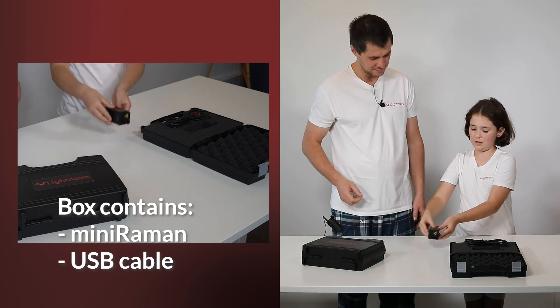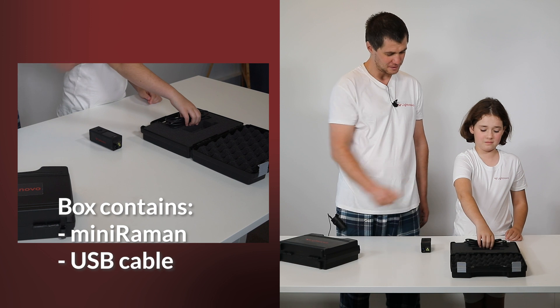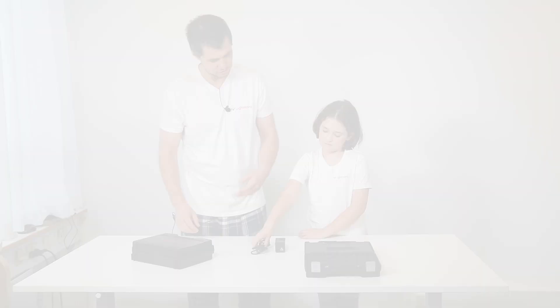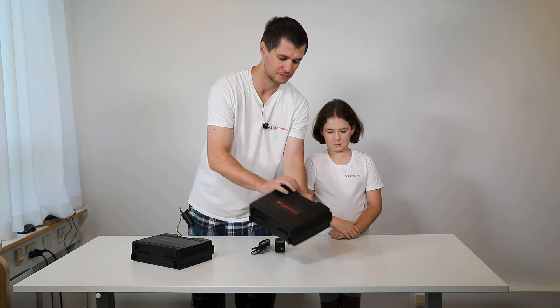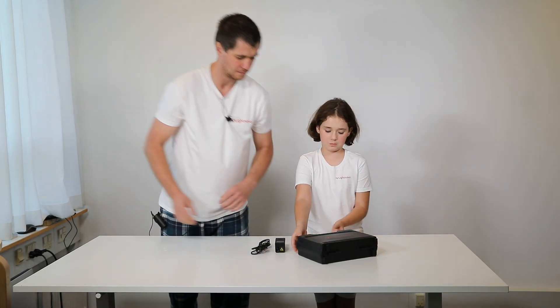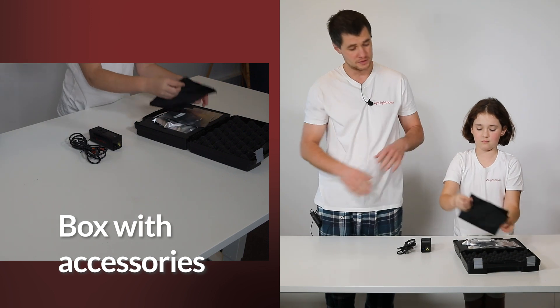So it contains... This is a Miniraman. Yes, very nice, and a USB cable. We can remove this box and open another one. This is a box with accessories.